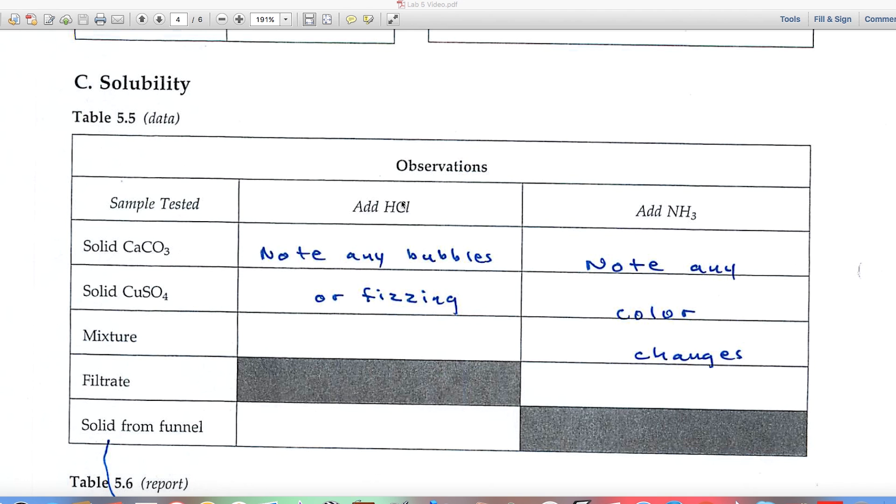Two chemical tests. We're going to add HCl and we'll add NH3. And here in the first case, note any bubbles or fizzing that occurs. One of these two is going to bubble or fizz, and be sure and record that. Well, the mixture then should bubble or fizz. And the big question is, does the solid from the funnel bubble or fizz? And you'll use that information to conclude which of these two the solid in the funnel is.